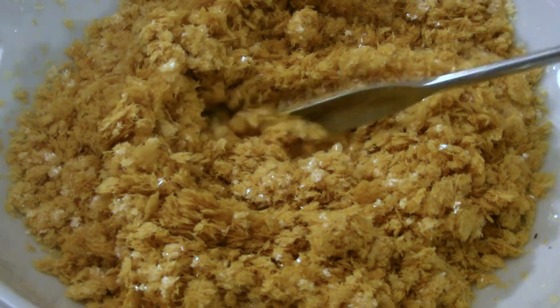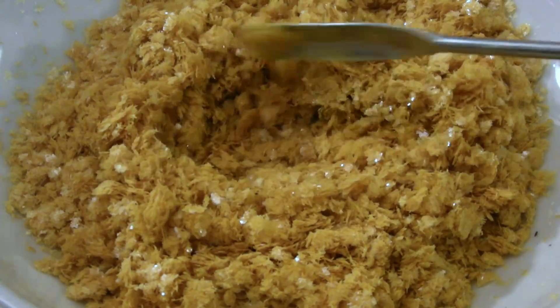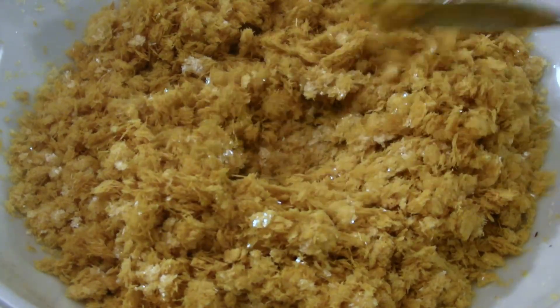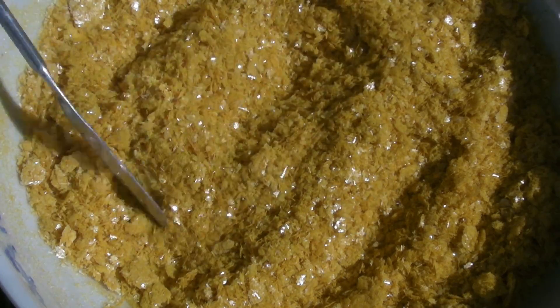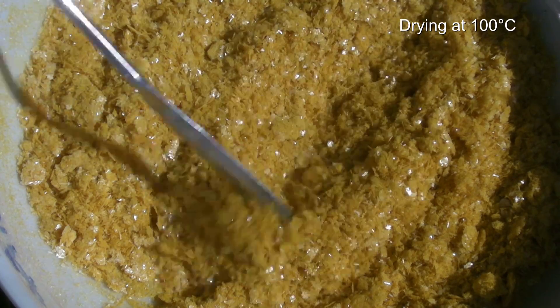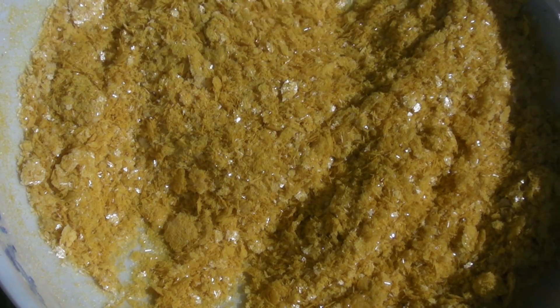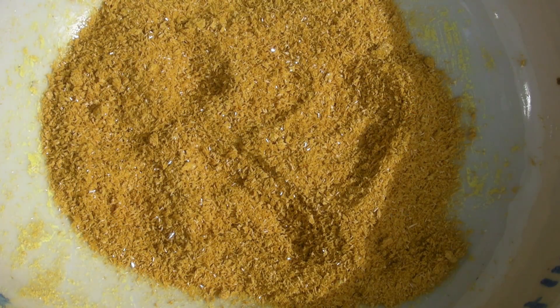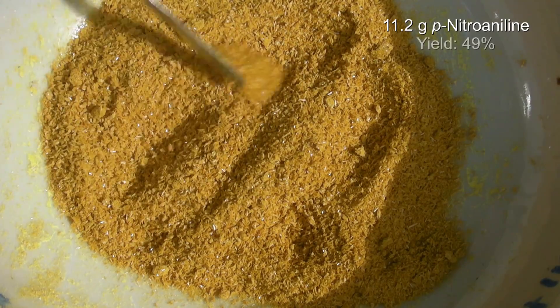The crystals were filtered off added to a large bowl and dried on air for two days. They seem to be dry but they still contain a lot of solvent which is removed by drying it at 100 degrees C. 11.2 grams of p-nitroaniline were obtained which is a yield of 49%.